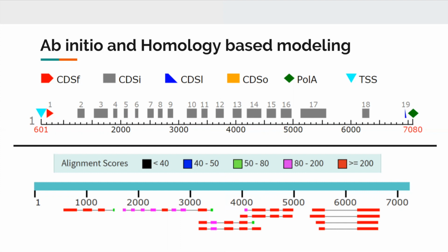And then on BLAST, we compared our sequence to the data that was available, and we saw that there was a lot of good alignment. So the red represented those good alignment scores. And there was some good taxonomy data relating similar alignments to other species. There were not a lot of similar alignments in Brachypodium on BLAST, but there were definitely a lot of similar proteins in other organisms. So mostly tobacco plants, rice, and Arabidopsis. And that's what led us to our library search.